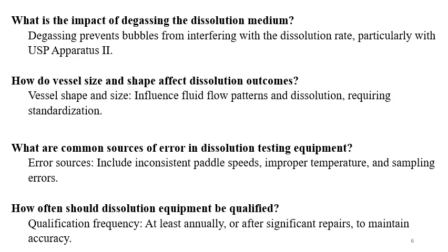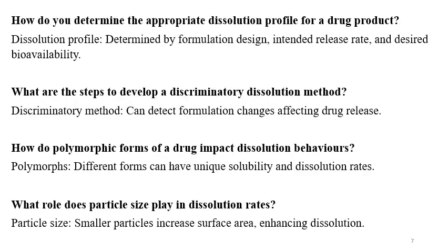How often should dissolution equipment be qualified? So at least 1 year is the frequency. Calibration frequency is at least once annually or after significant repairs to maintain the accuracy.